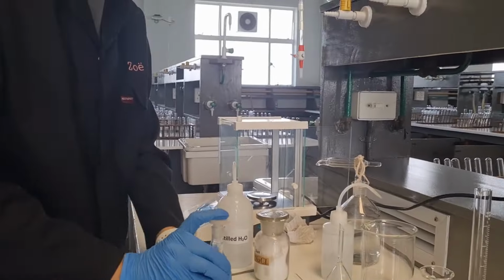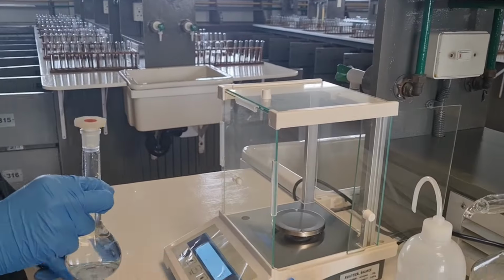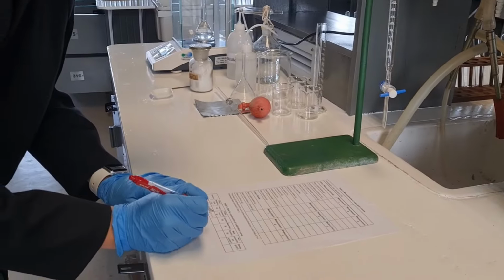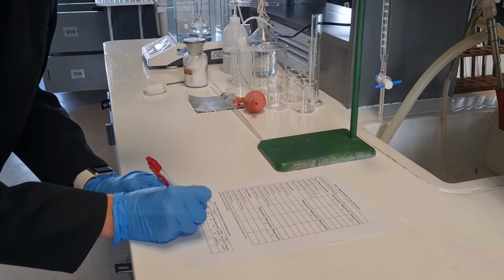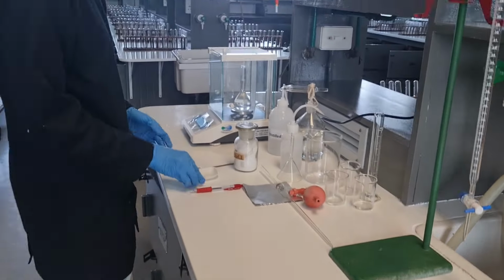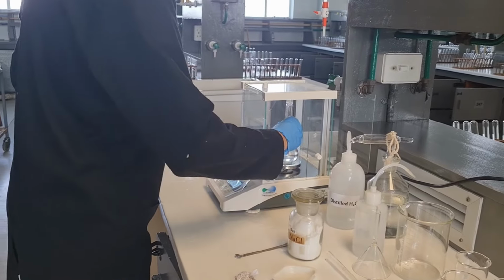In step 6, shake the solution well to ensure that it is mixed well, and then weigh the volumetric flask with the solution and record its mass. In the last step, once you have all of the required data, discard the solution in the correct waste vessel in the middle desk of the lab.